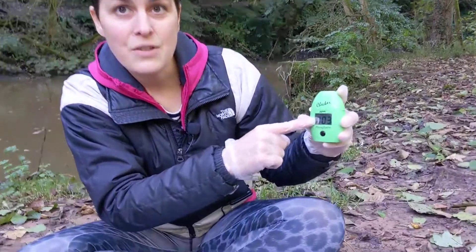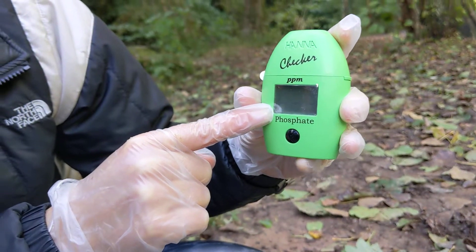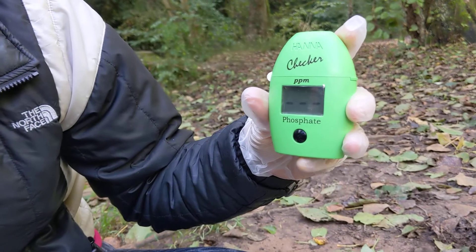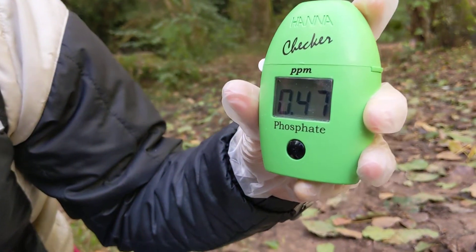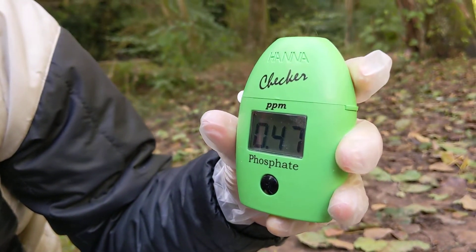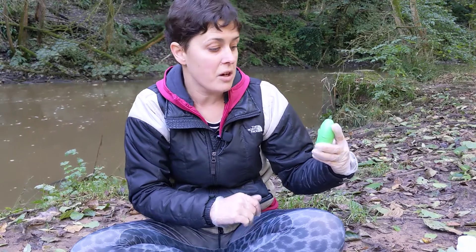After the countdown, we wait for our reading to appear. Today we've got 0.47 ppm phosphate in this watercourse. There's been a lot of heavy rain in the past few days so I expected a reasonably high value. I'll put that in my EpiCollect app later on and scribble it on a piece of paper now so I don't forget.